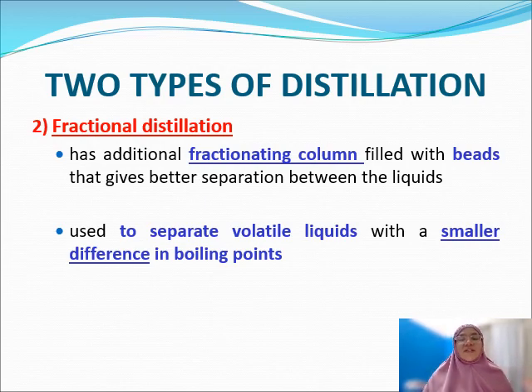And this fractional distillation is used to separate volatile liquids with a smaller difference in boiling point. So the volatile ones will be separated, whichever volatile liquids will move first compared to the less volatile compounds.